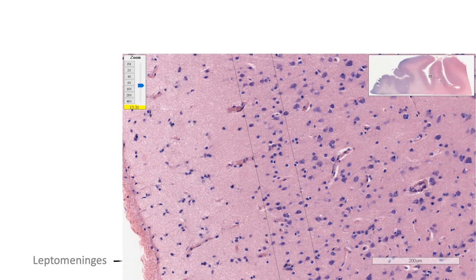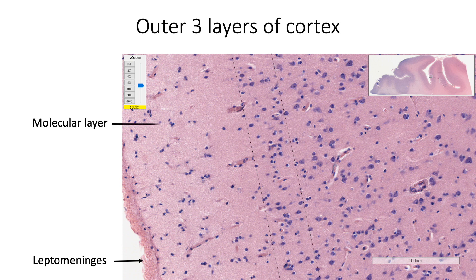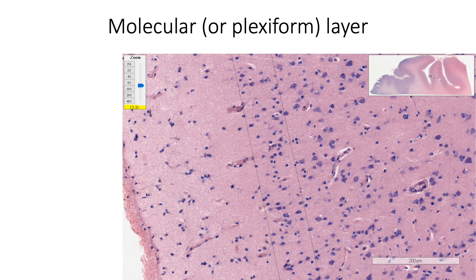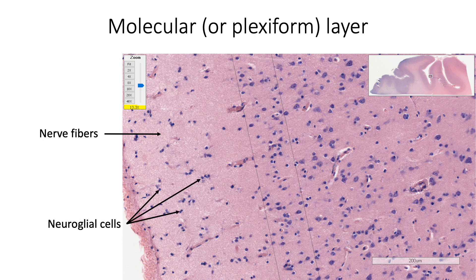Inside the covering of three layers of meninges, the outer three layers of the cortex include the molecular layer, the outer granular layer, and the outer pyramidal layer. The molecular or plexiform layer is the outermost pale area, just beneath the pia mater, and it is mainly made up of nerve fibers. Therefore it appears pale. The cells in this layer include neuroglial cells, which appear as naked nuclei, and a few horizontal cells of Cajal.